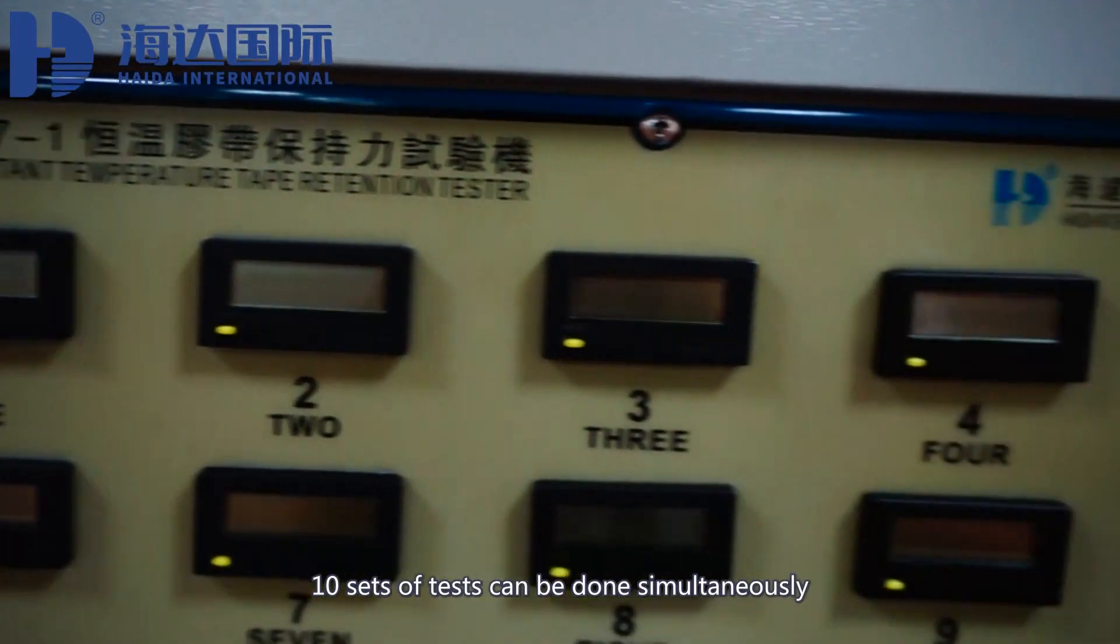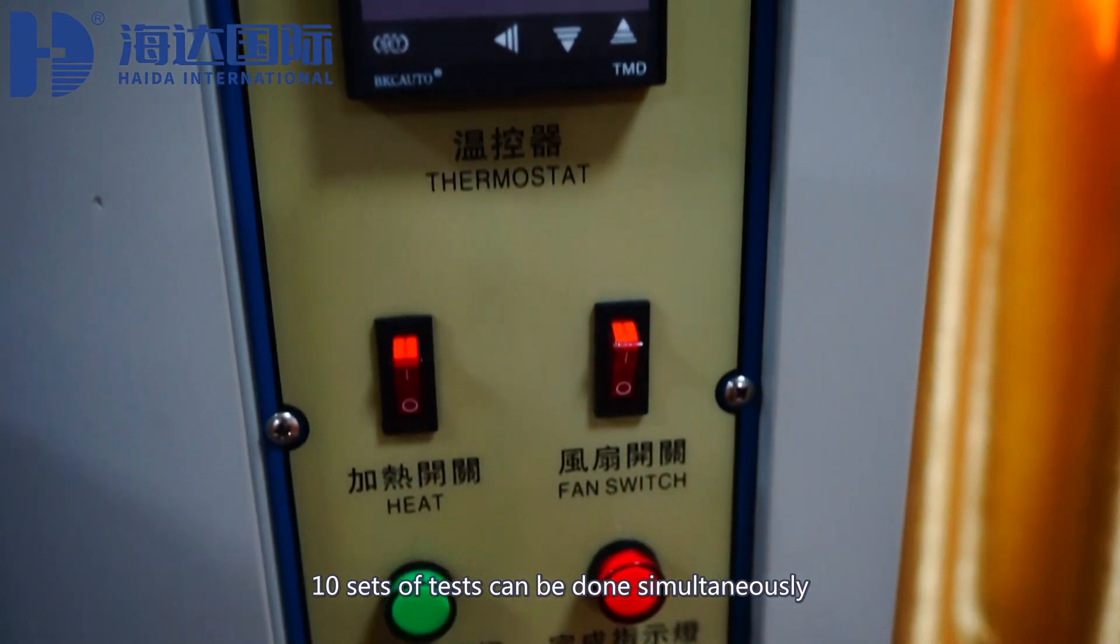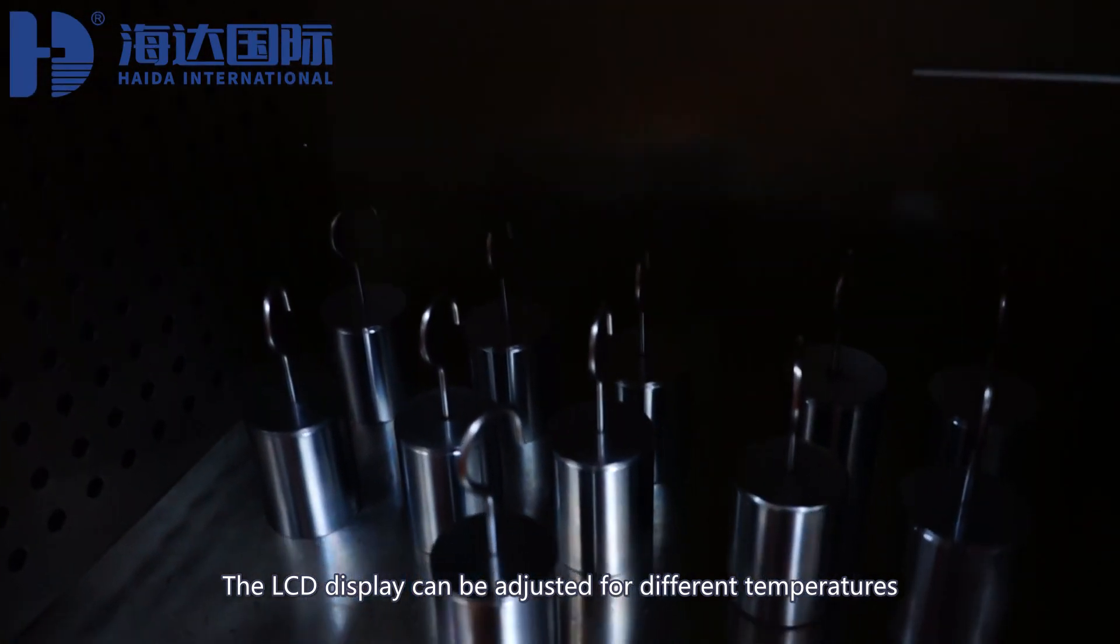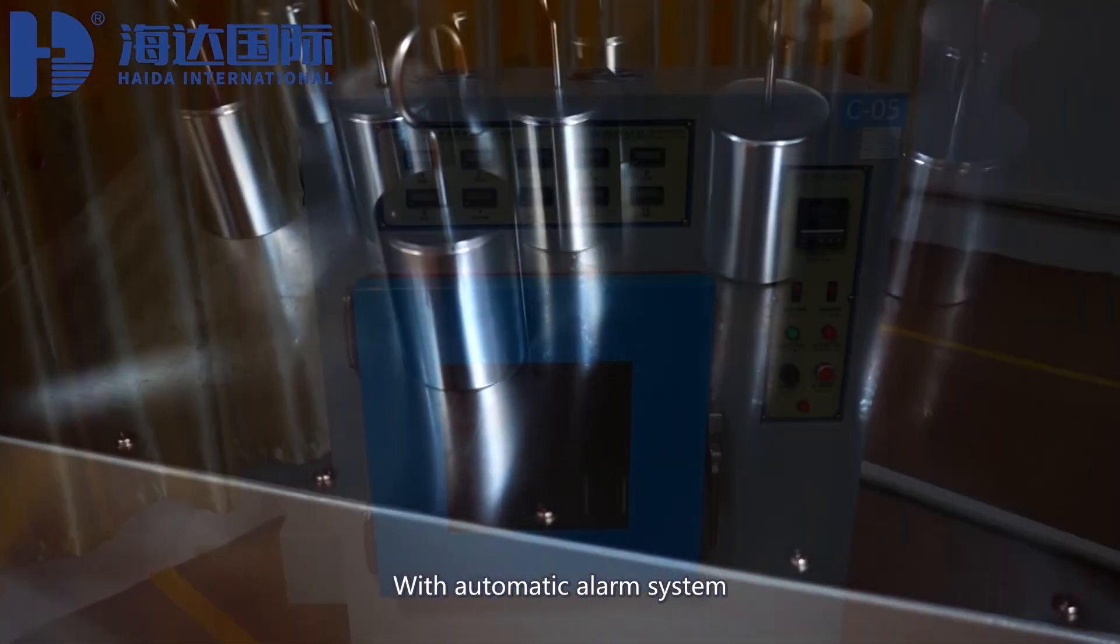10 sets of tests can be done simultaneously. The LCD display can be adjusted for different temperatures with automatic alarm system.